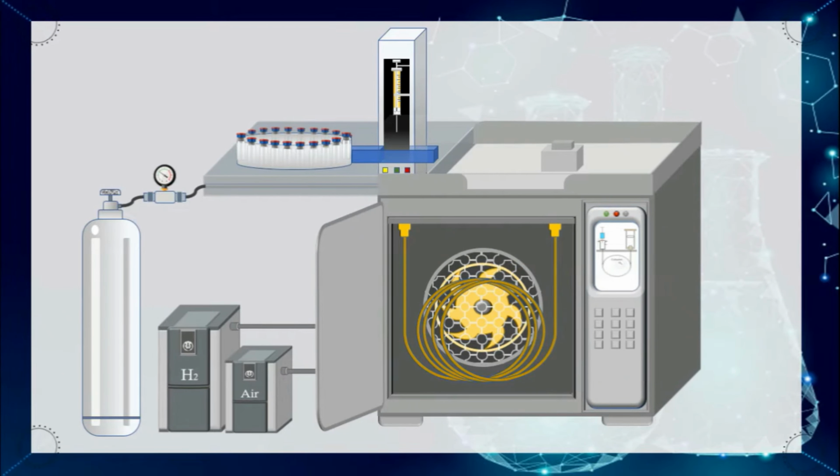First of all, carrier gas will come from here, then we will apply the sample, then the sample will be passed through the column using the mobile phase, like helium or hydrogen, and these are the coiled column. This can be a capillary column or packed column, whatever the column is. The sample will be passed through it, and after that it will come into the detector. Here we have used a flame ionization detector. However, a lot of detectors can be used. We can see here the overall pathway of sample passing.